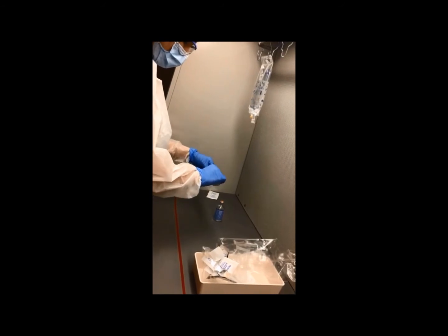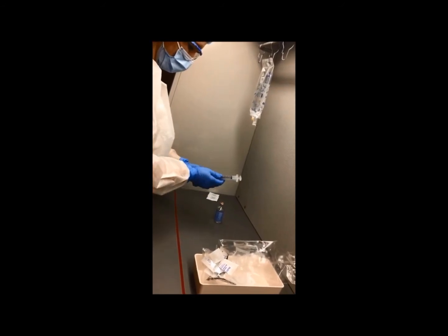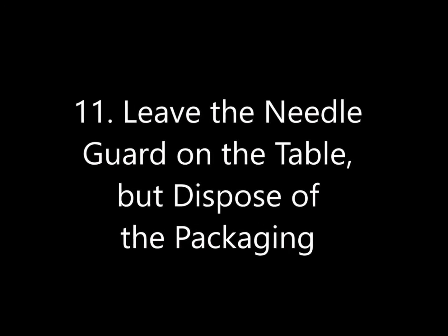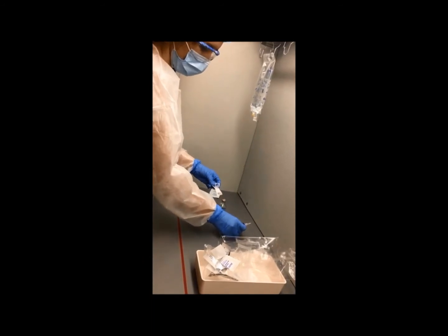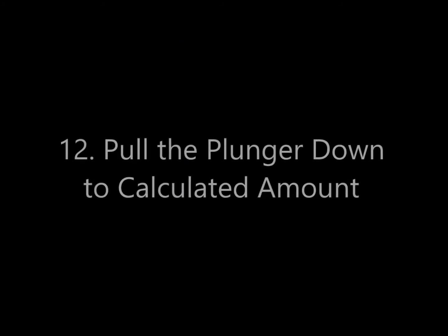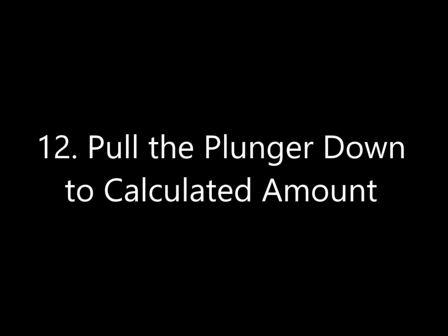Step 11: Leave the needle guard on the table but dispose of the packaging. Notice the needle guard is left on the counter. Step 12: Pull the plunger down to the calculated amount.